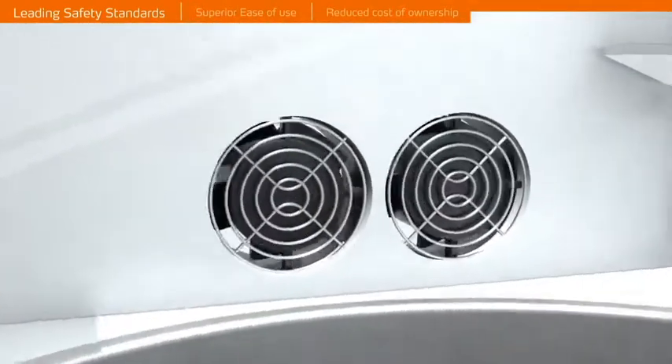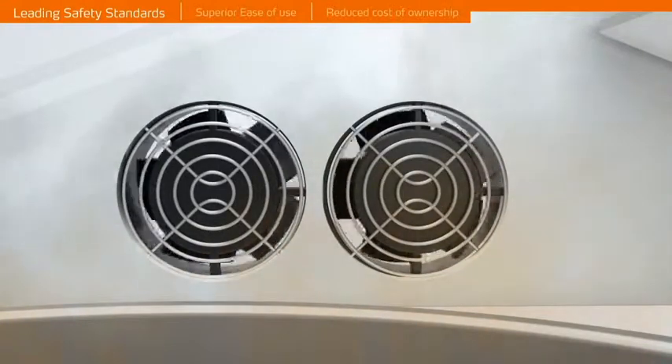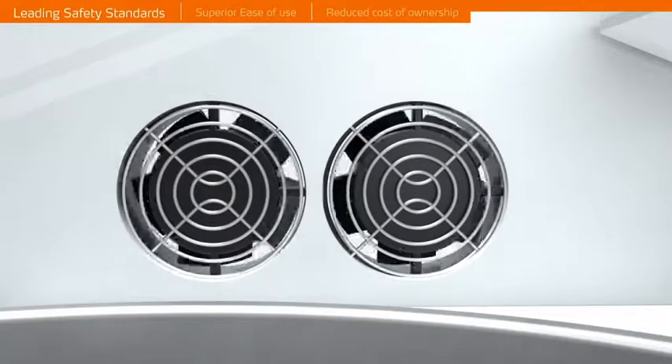Non-fogging tempered safety glass along with two strong ventilation fans prevents steam build-up inside the hood and provides clear, visible monitoring of the evaporation process.